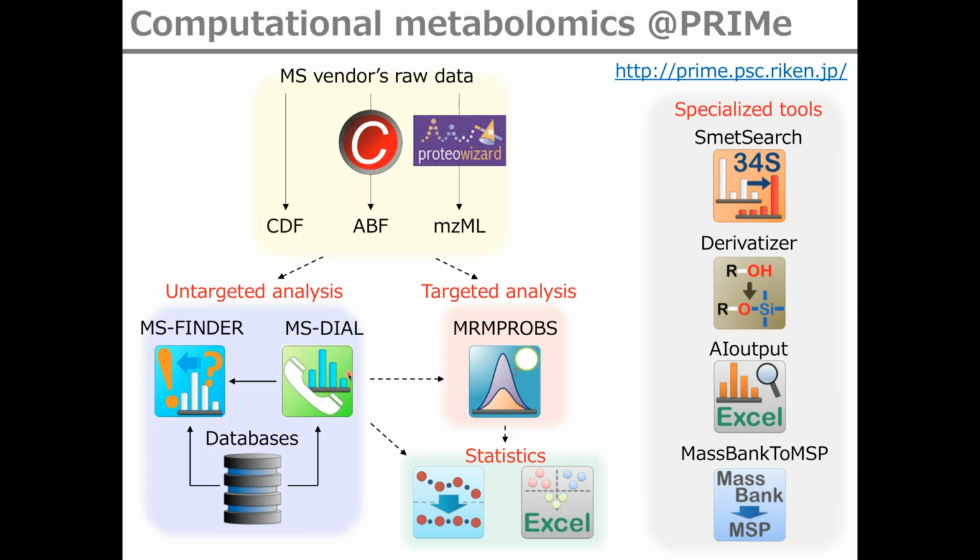MS-DIAL was optimized for untargeted analysis, and MRMPROBS was optimized for targeted analysis. These programs can import mainly 3 data formats, CDF, ABF, and mzML, although the ABF format is only available at my software program.